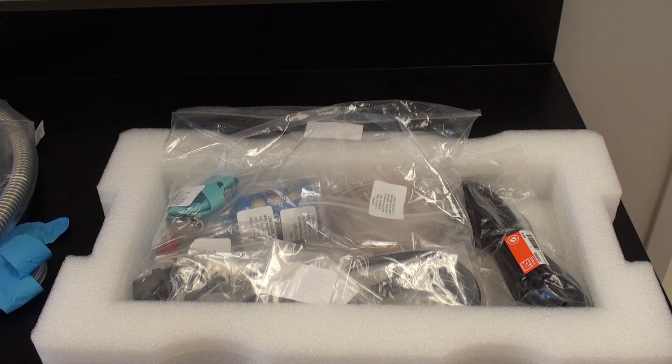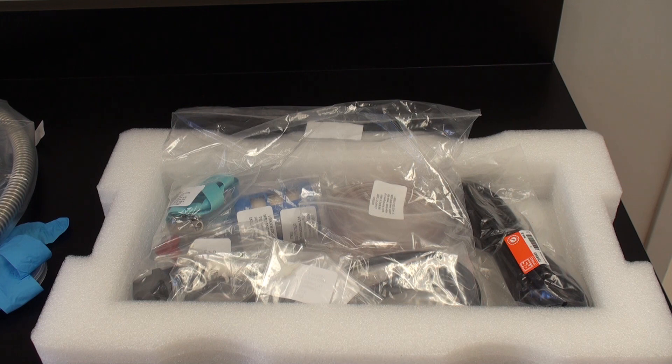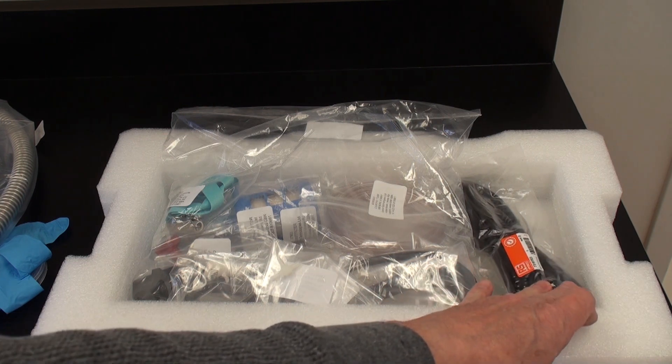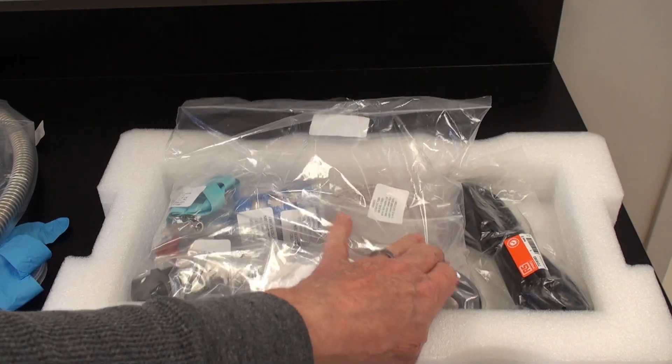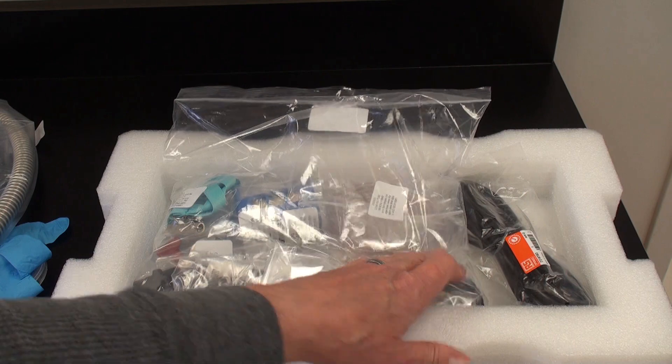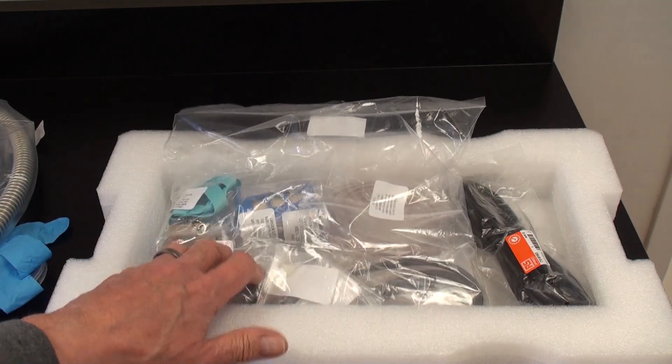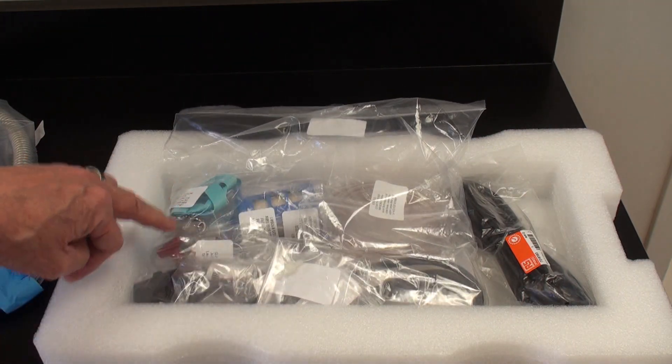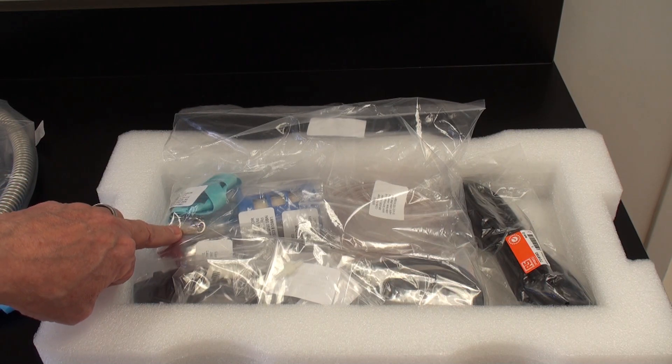This is the accessory pack that comes with the instrument which has all the fittings you need to install, set up, and operate the MiniQS. You have the modular line cord, you have the power cord which goes from the MiniQS to the rotary pump, you have the oil mist filter, you have the tubing, you have the necessary clamps. The user guide is on this USB thumb drive. It comes with a gold target which I'll show you how to install next.